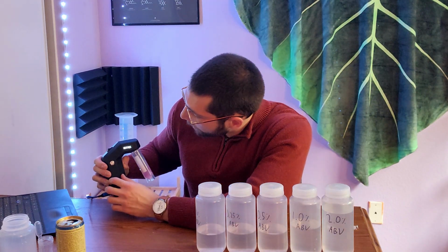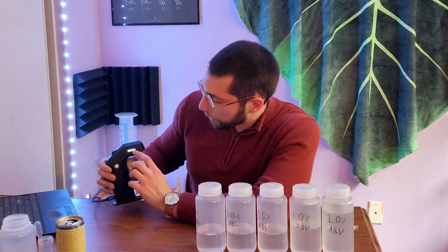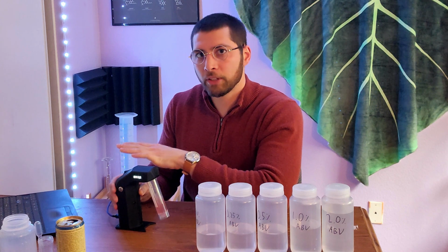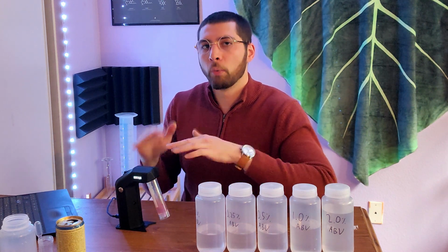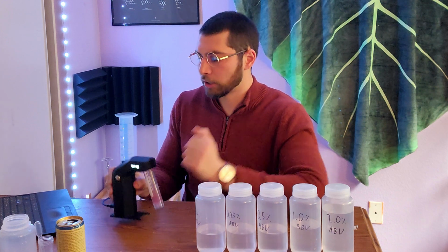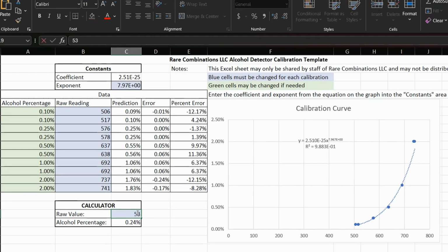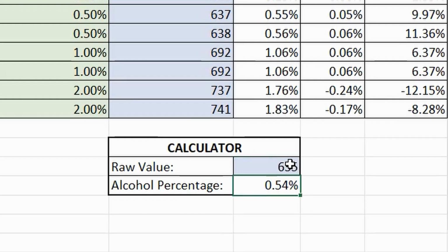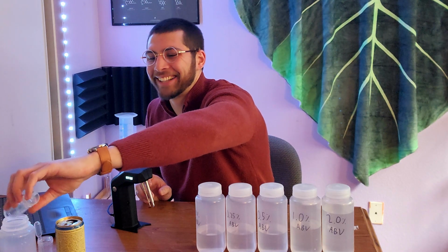So I'll take a peek at that now. It's about 635. And the temperature I'll take a note of, it's 20.4 degrees Celsius. I made this calibration curve at 19.9 degrees Celsius, so we're within spec. We want to be within about 1 degree Celsius of our calibration curve. And in fact, we are. So this is 635. So we'll put this into our calculator and see the alcohol content. So this June kombucha is 0.54% alcohol. I'm not going to tattle on anybody.